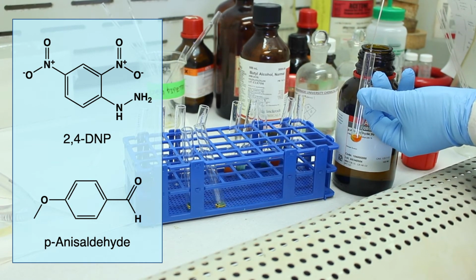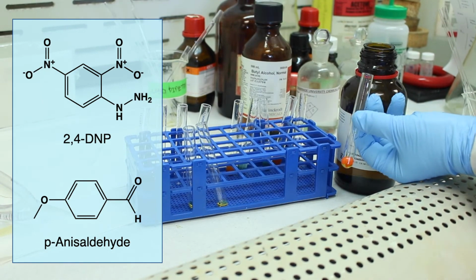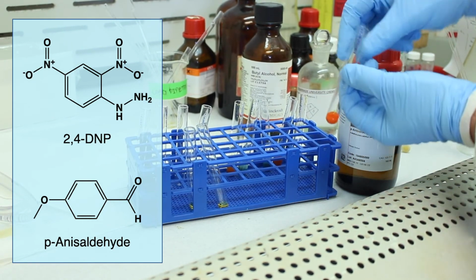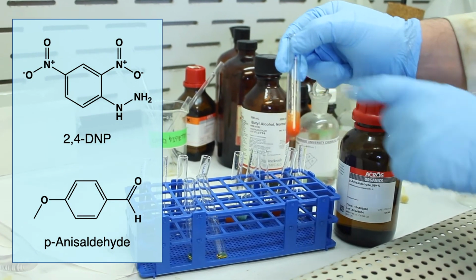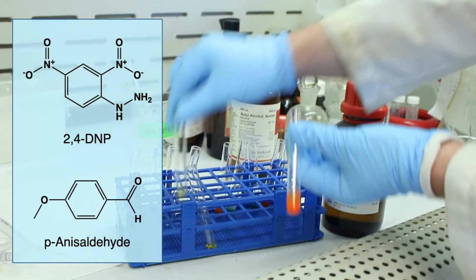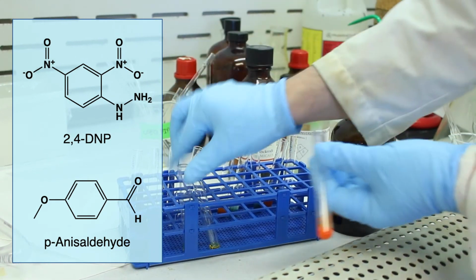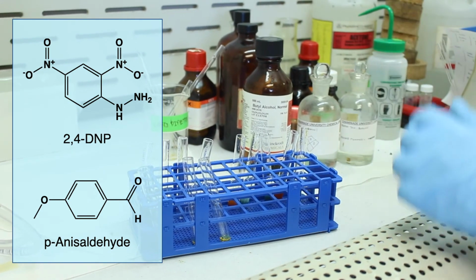There you go. You can already see it's a very fast reaction. There you go. Don't even need to agitate it. You can already see that there is a positive test. So orange precipitate, kind of like a pumpkin, Halloween orange, compared to the pure reagent. So you can definitely see a difference there. So this was our p-anisaldehyde, knowing that aldehydes react.